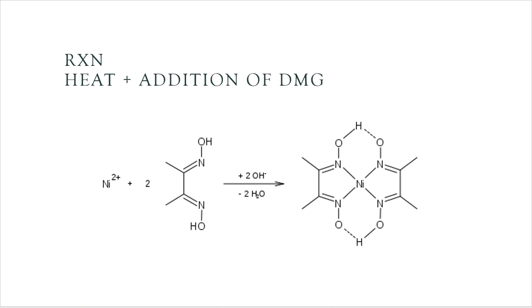When I add the DMG, which is this compound here, this DMG begins to surround the nickel, and it cages it. Look at that. And it's the nitrogen pieces that reach out and grab that nickel to form this precipitate. So 1 DMG to the left and 1 DMG to the right. It told me that a precipitate would form.